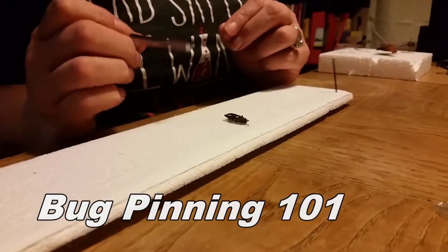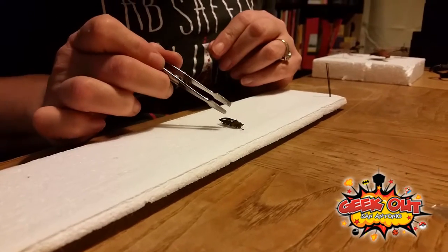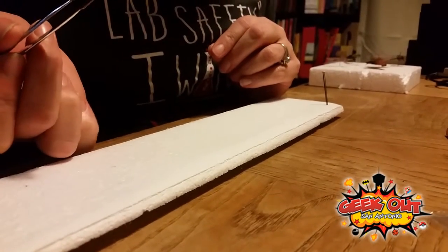The first thing you're going to do is find out what bug you have, because each different bug has a different place that you pin them.